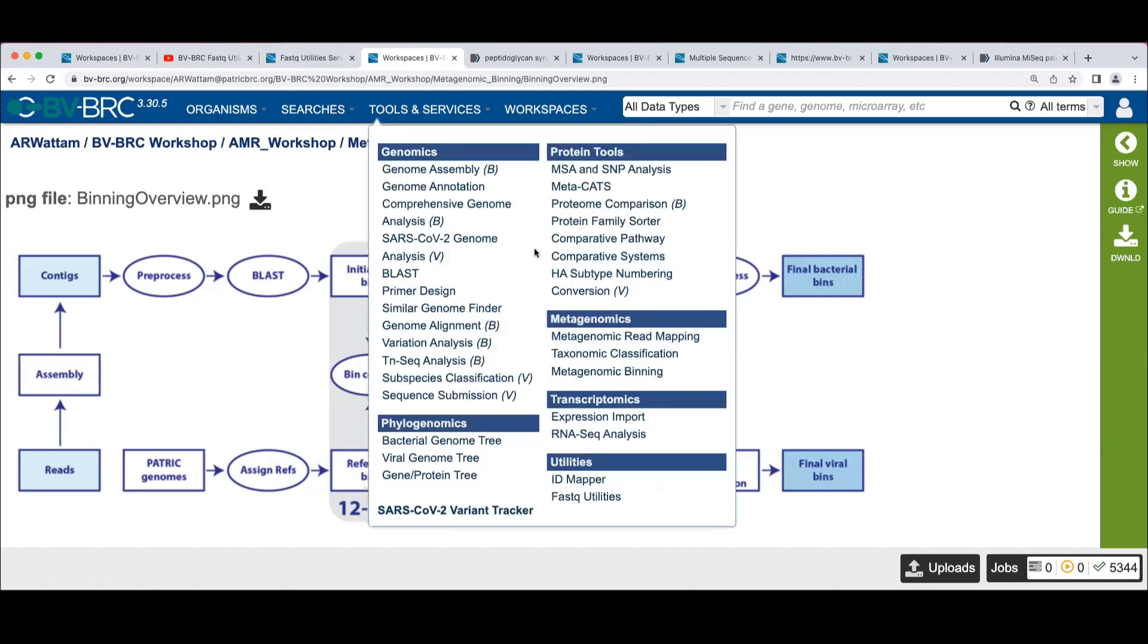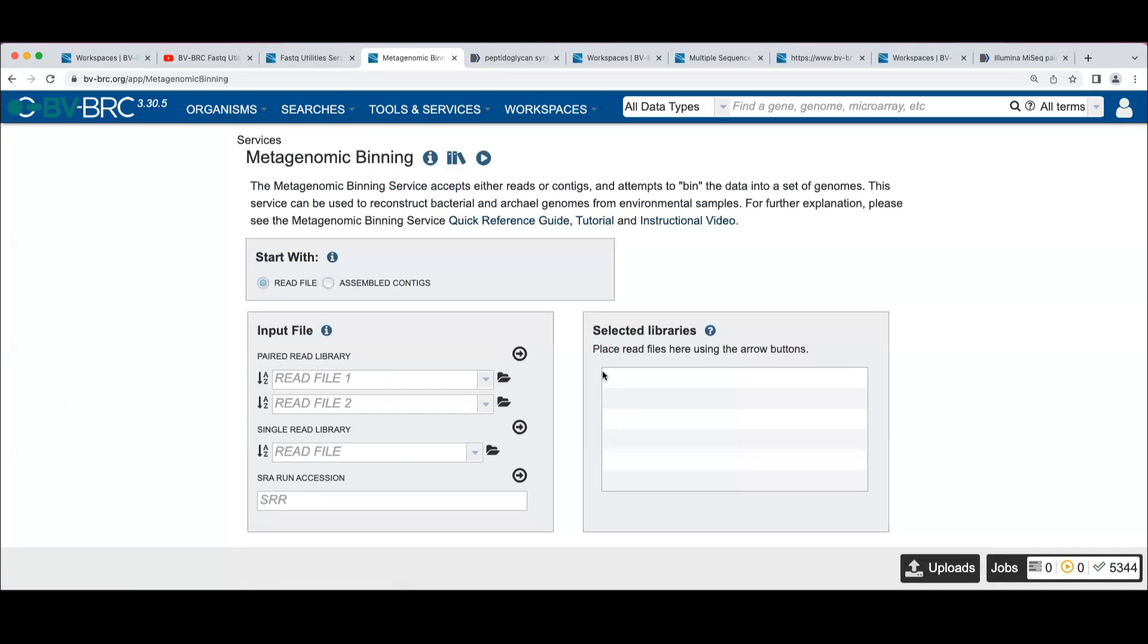So we'll go over here. Under metagenomics, we have a metagenomic binning tool. And this will look familiar now, the sense of theme with these tools, right?